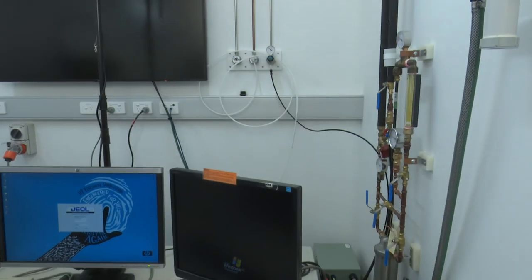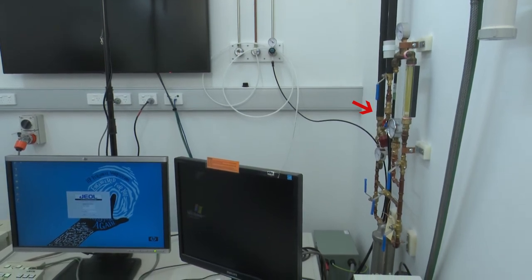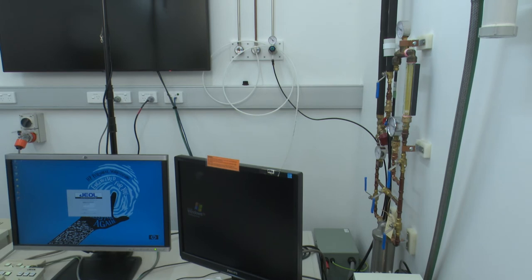pressure. To the right of that, we can see our water supply coming in, and our water supply is again set at a particular flow rate. These things are not under operator control. They are looked after by CMM staff and service engineers.